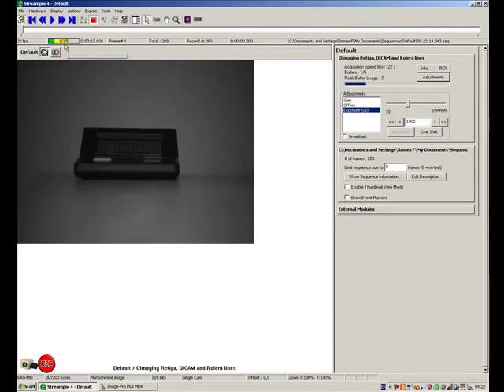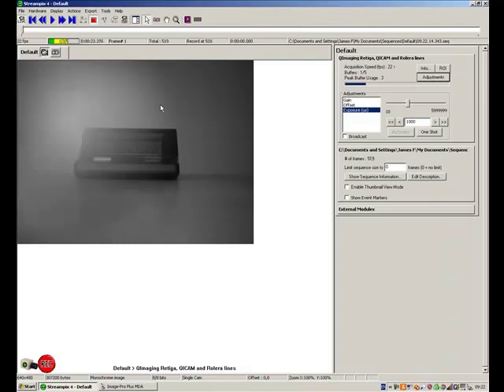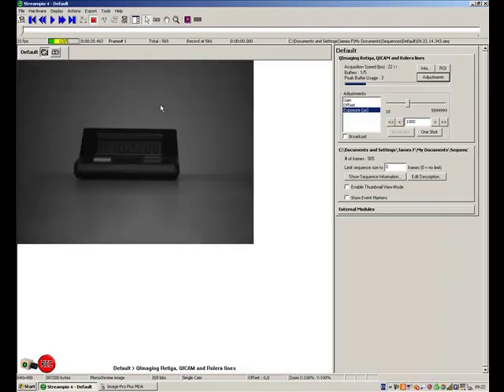What's really nice about StreamPix is I'm recording at the rate of the camera, and you can see actually my buffer usage here, so where I'm actually at peak and total, so it's best to have a good hard disk, and actually StreamPix has some utility to test that. But the nice thing is that I'm pretty much live. If I just put my hand in front of that, you can see there's no cutoff. In lots of packages, there's a cutoff between streaming and acquisition.